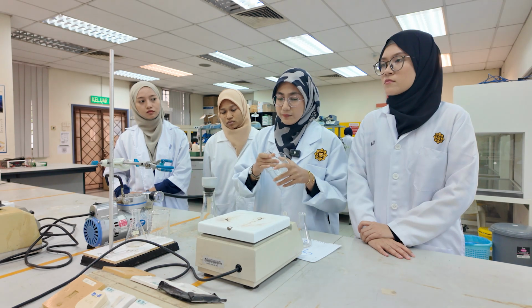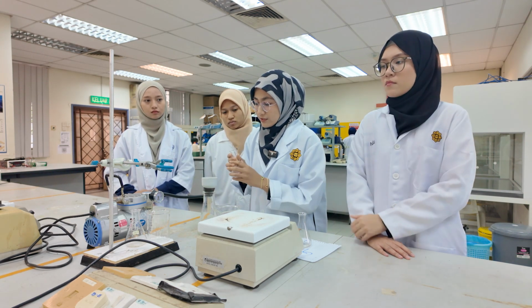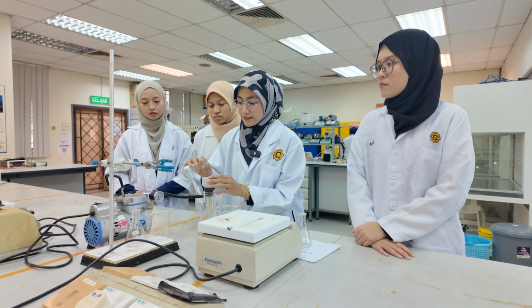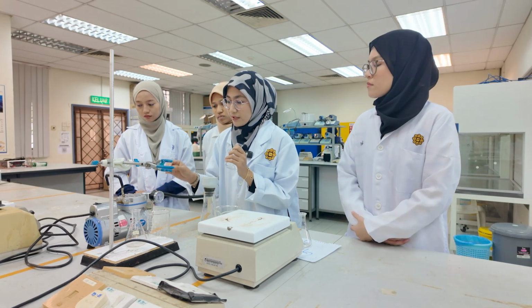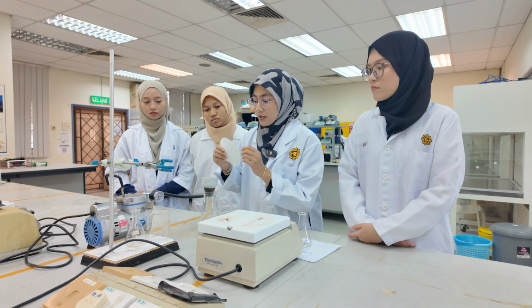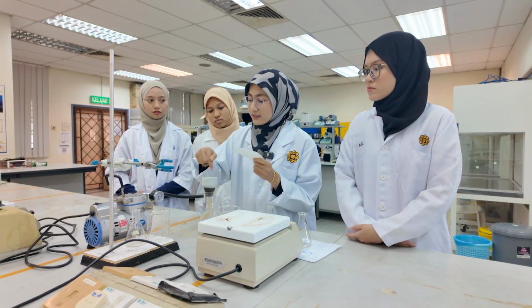Just imagine in this beaker we have ice, and you need to pour this solution into this filtration funnel. But make sure the switch of this pump is on, and you have to put this filter paper in this filtration funnel, but you need to cut it to this size.